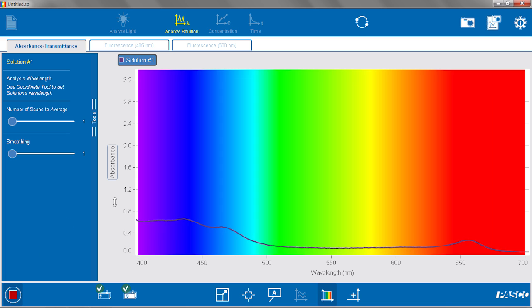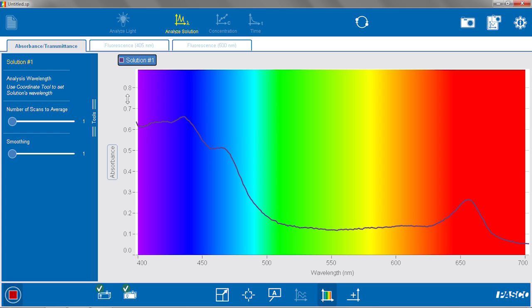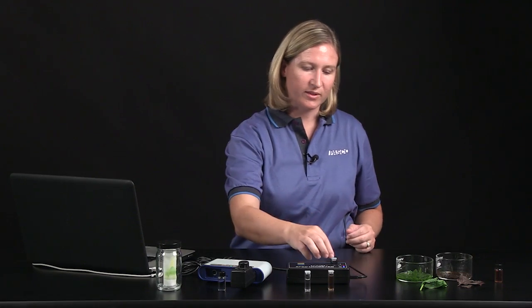You can see a higher absorbance of blue light and red light. I can get a better view of this data by clicking and dragging on the axes. Biology teachers wouldn't be too surprised at this result — again, the peaks are in the blue and red wavelength ranges. But this is really cool for students, because typically they only get this view from a picture in their textbook. For them to extract pigments from real leaves, put it into a spectrometer, and get the absorbance spectrum themselves is a really meaningful activity.